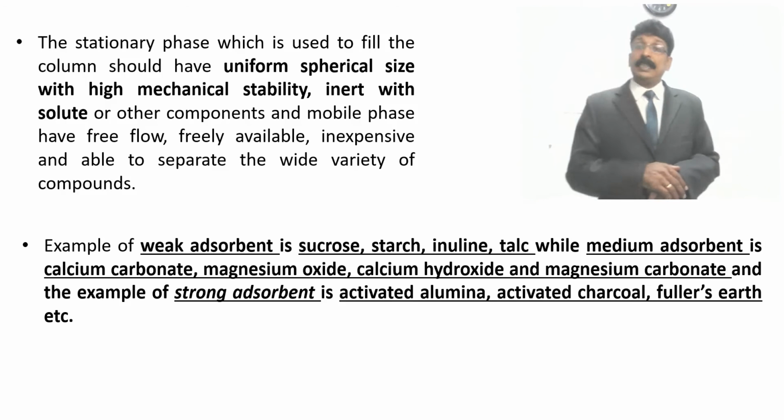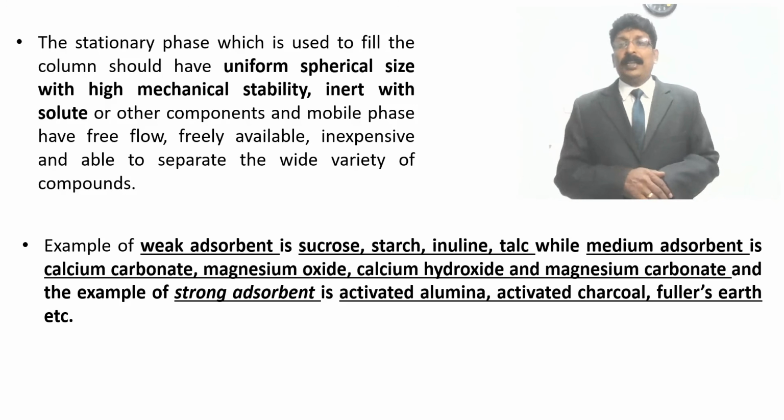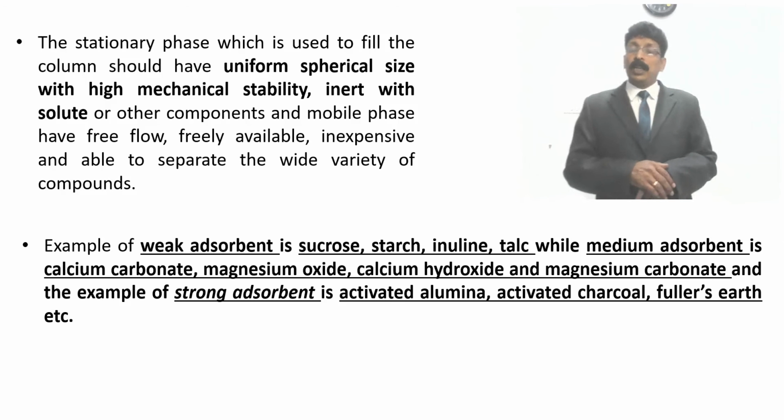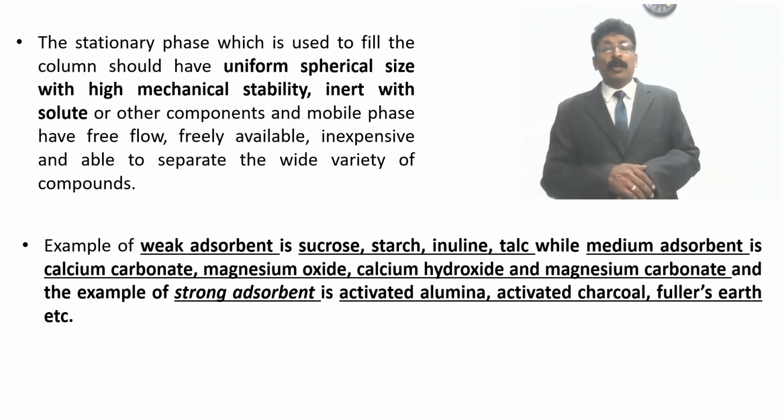Even the TLC plates, when you prepare them for the experiment, we say activate. Activate means to remove the unwanted moisture or water which may be present, which will hinder our experiment for the separation of the compound.